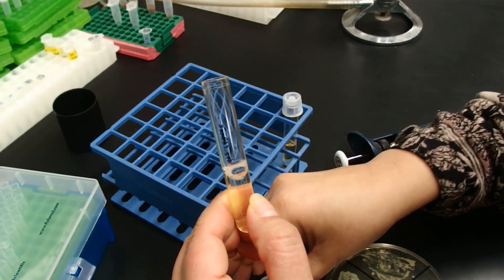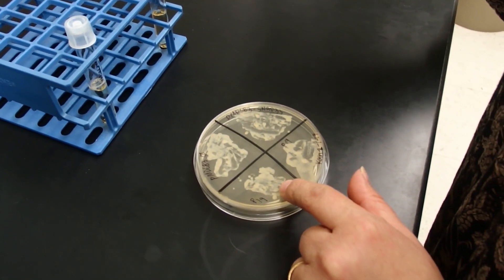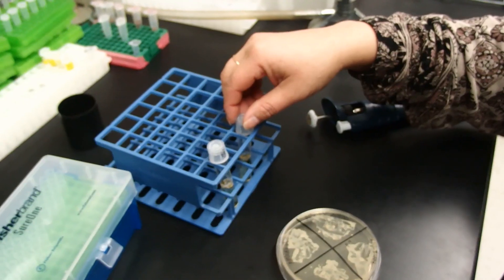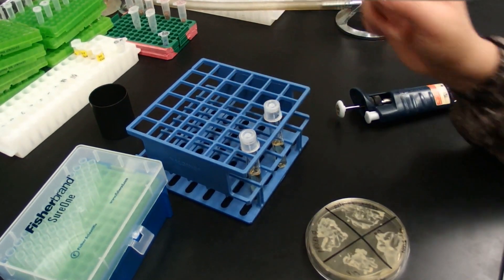I'm going to do the same with the other culture containing the P19. We are going to shake the cultures at 28°C overnight.